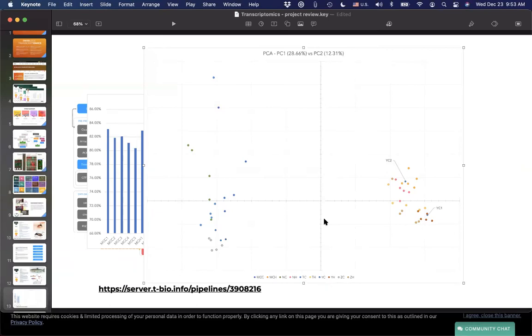One good way to validate that it is a mislabeling problem is, if you throw them out, could you improve these numbers right here, the variability? This is the best way to take a cloud of points and do a projection. If you throw them out and the variability within each group is reduced, then you should expect these numbers to go up.